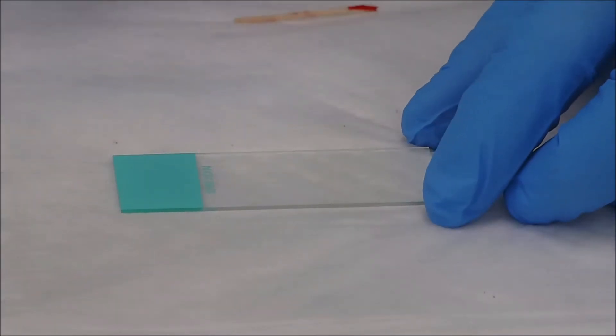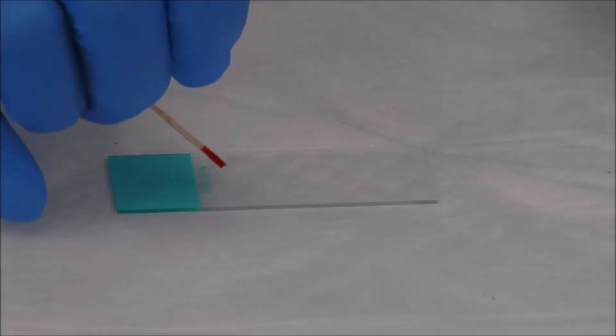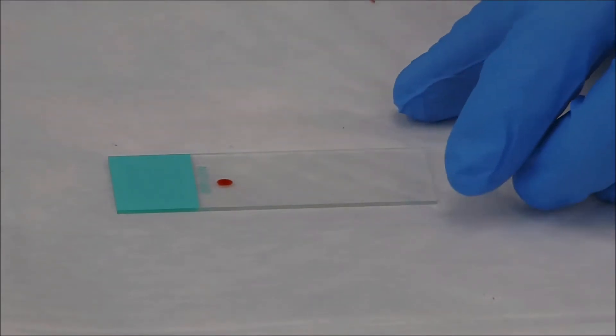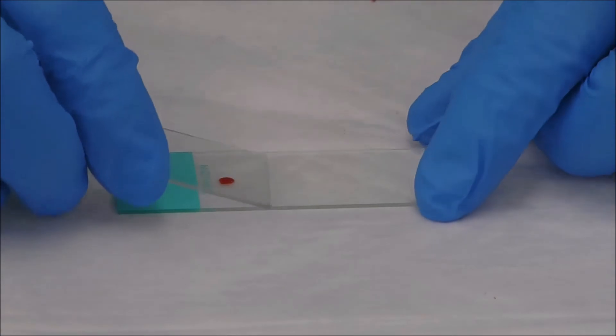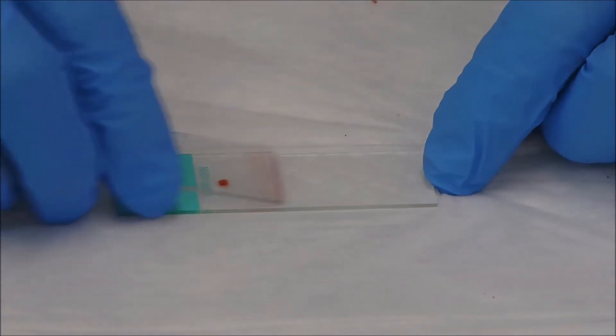So once again, we're going to take our sample, place a little drop of blood there. And then take our spreader slide, which we have to have ready. We're going to pull back over that, wait until it runs up and down, and then push forward evenly.